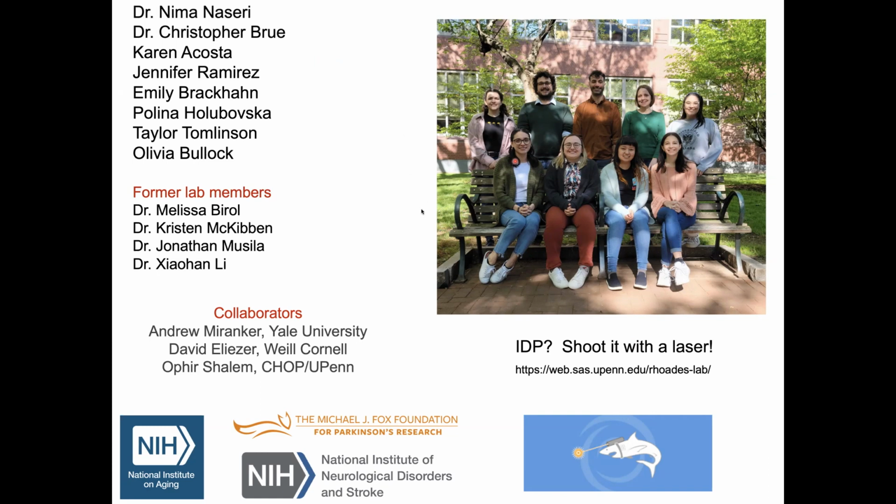So I've always been fascinated by the distribution question that you show, Liz. When you take these measurements, does that mean you're taking multiple 10-second measurements of the same sample? Or are you taking one long 1 hour measurement and chopping it up into little bits and then analyzing each individual section differently? How are these measurements distinct, and how are they different?